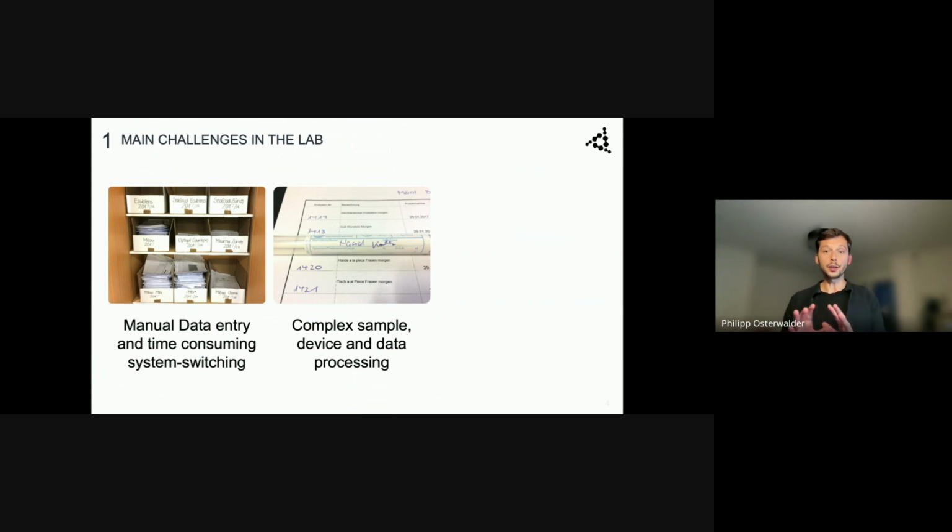So there are a lot of skills and a lot of different tools needed today because of the organic growth of the company. Based on the different challenges, they introduced and implemented different tools. At a certain point, there is no need for a 10th tool which just focuses on handling laboratory data.